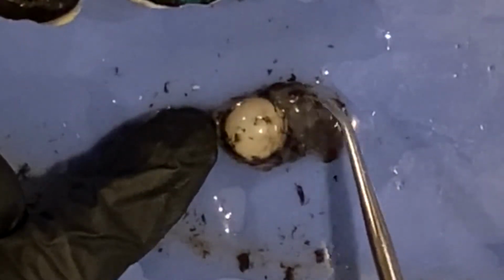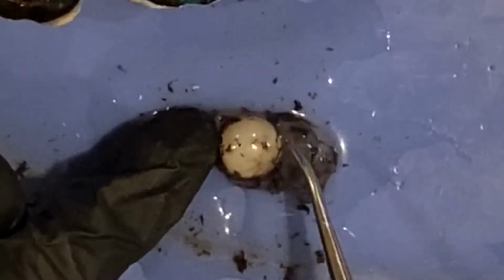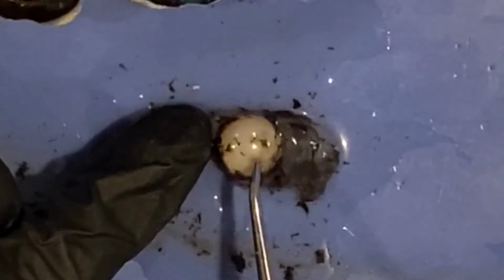You can also see that there is this gelatin material that's attached to it. This is called the vitreous humor. This is part of the posterior segment of the eye. The posterior segment is anything posterior to the lens. The anterior segment would be anything anterior to the lens.